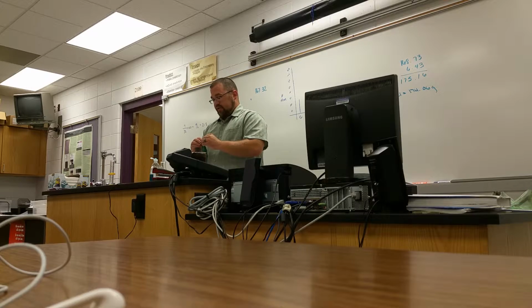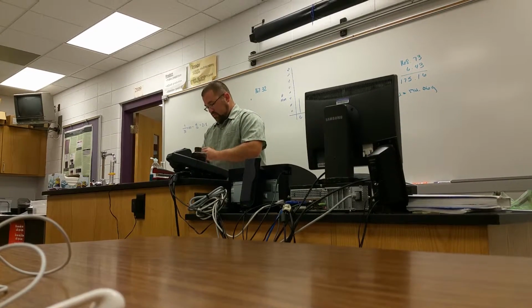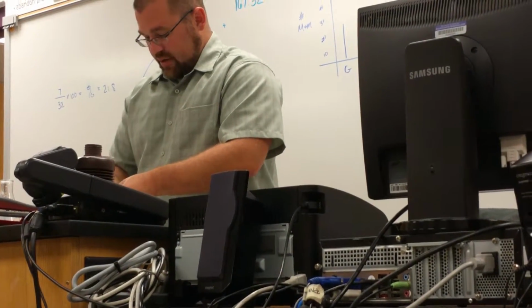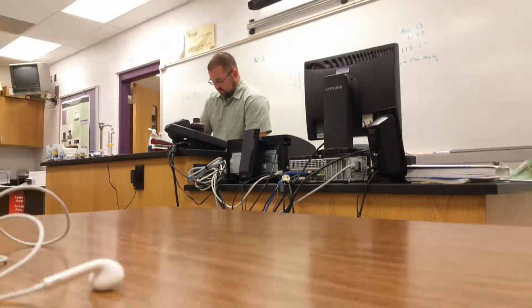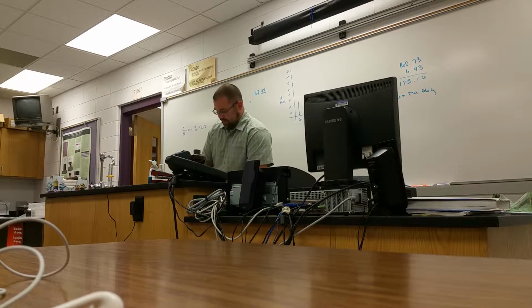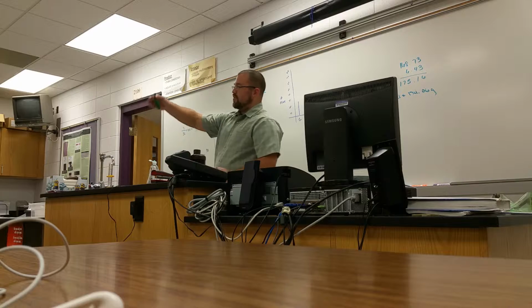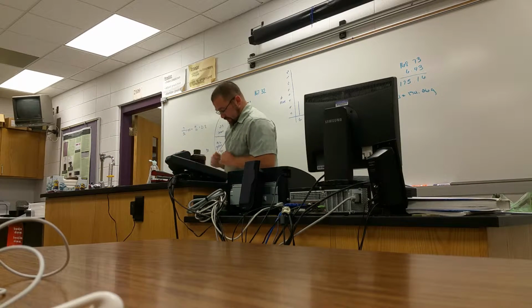So I'm going to go ahead and try to cram some of this stuff in here. Shouldn't be this hard. There we go. That one goes in there. Now remember, we're doing it this way because we don't want to lose any of the gas. So we want to make sure the container is closed before we do this. So then we can weigh the mass of the balloon and the Alka-Seltzer together.